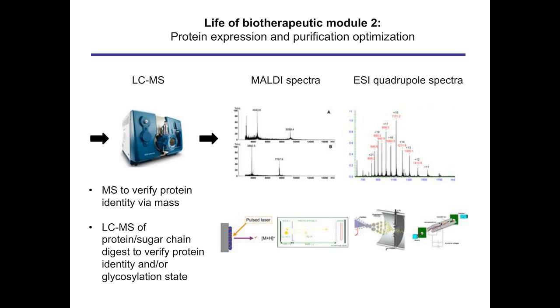And typically these peptides will pick up one positive charge under the conditions, and then one simply times the amount. This is all automatic, but the machine times the amount of time that it takes to accelerate your peptide until it hits a wall, a photomultiplier tube. And through this process, one then calculates a size to charge ratio, which I depict in the spectra on the top.